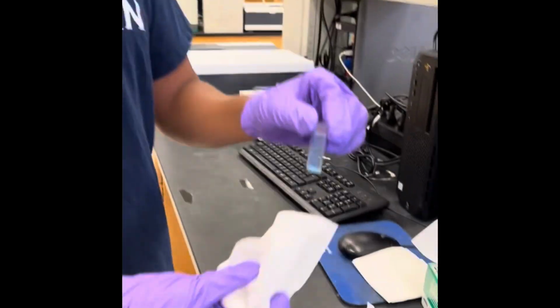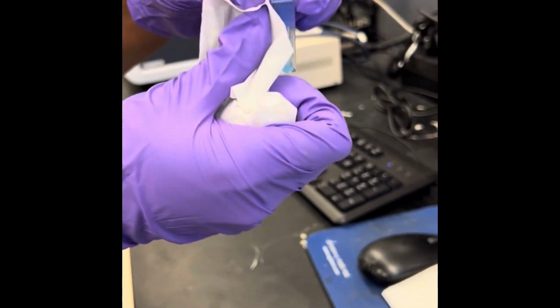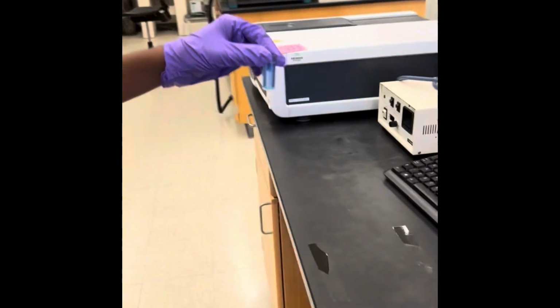Each absorbance scan will then be recorded into the notebook. Each member carefully removes each sample from the spectrophotometer and closes the door once removed.